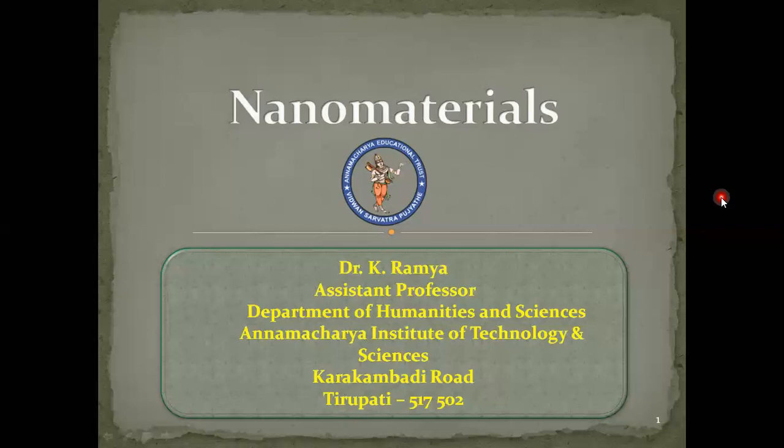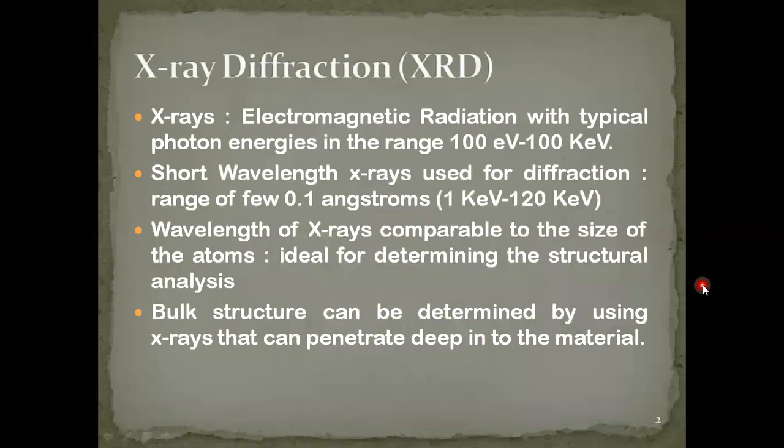So let's get started. XRD, X-ray diffraction. I have told you that we are going to do the structural analysis, structural studies. But before going deep into how we are going to analyze the structure, first we have to know why we are using X-rays instead of all the other rays. So why are we using X-rays?